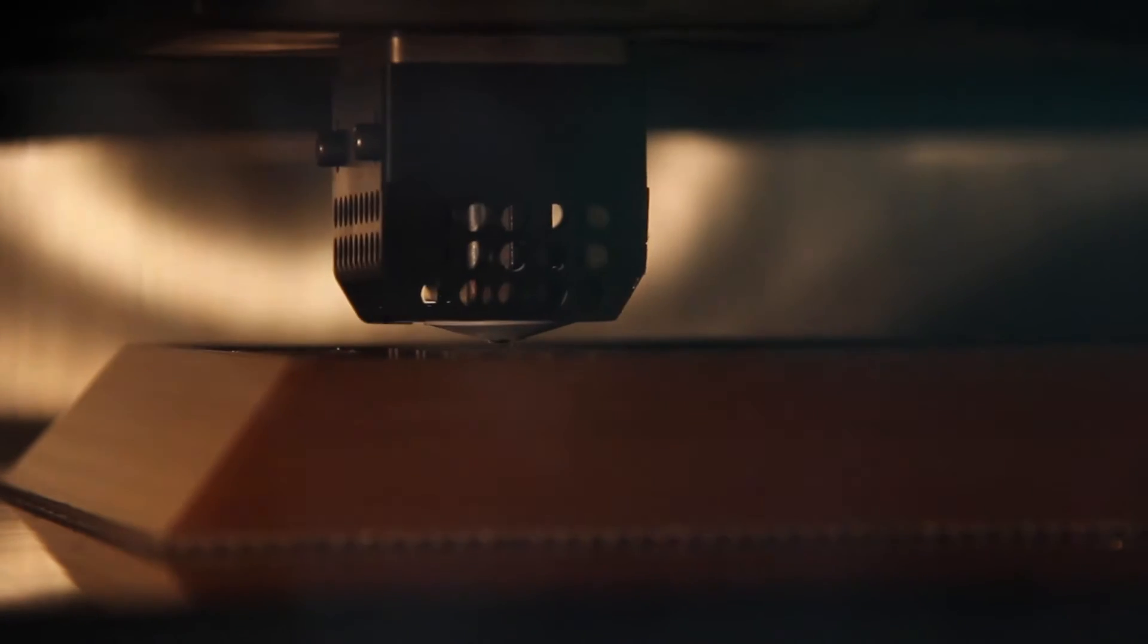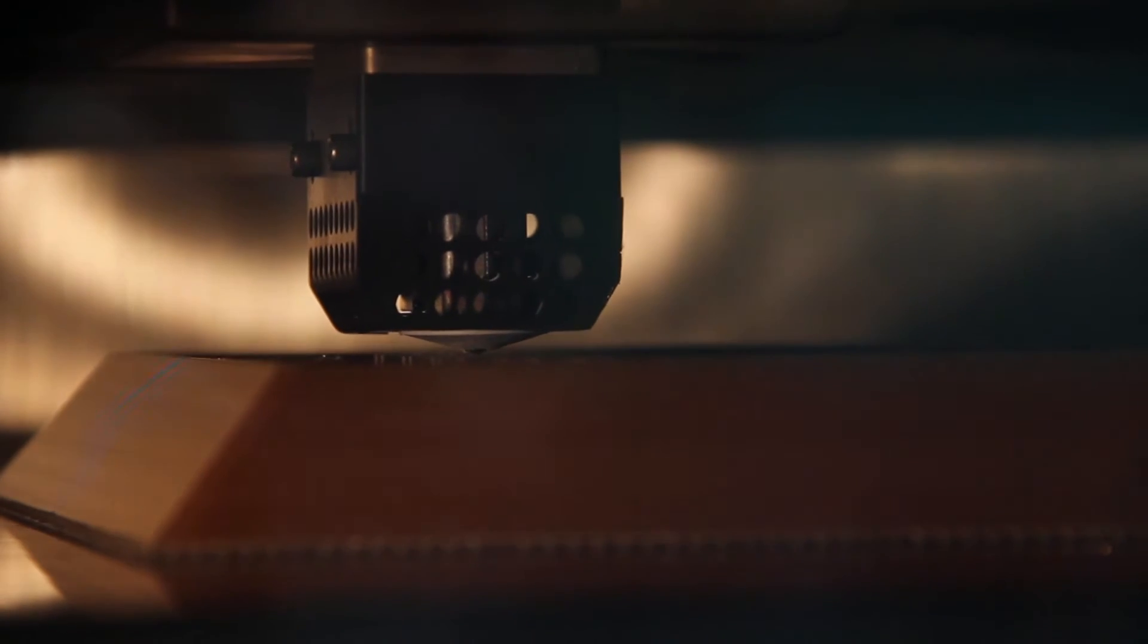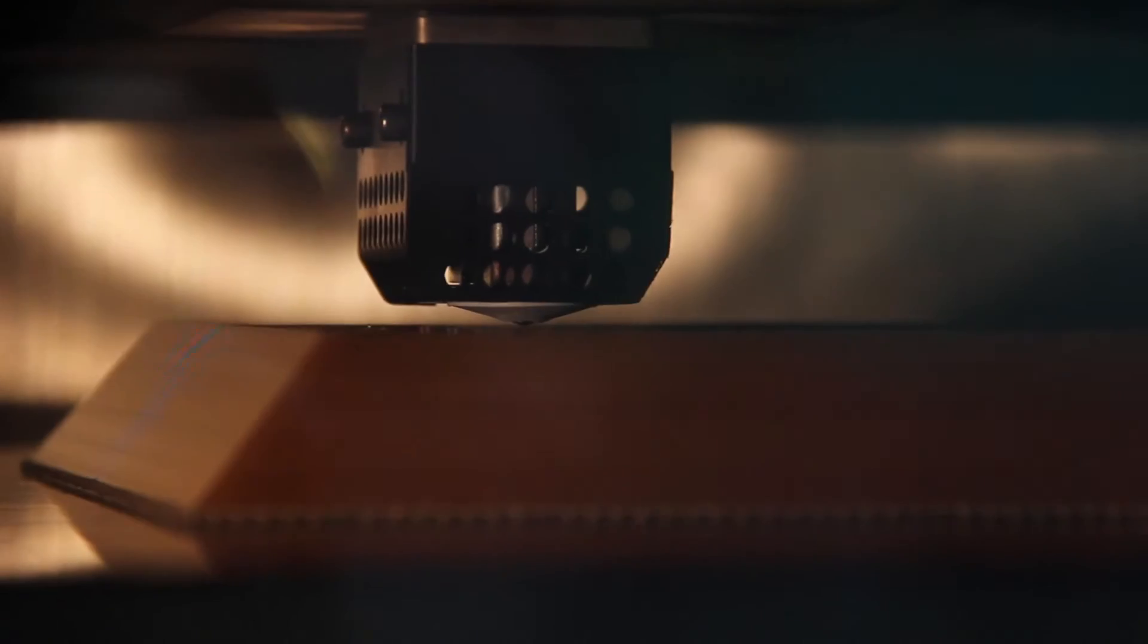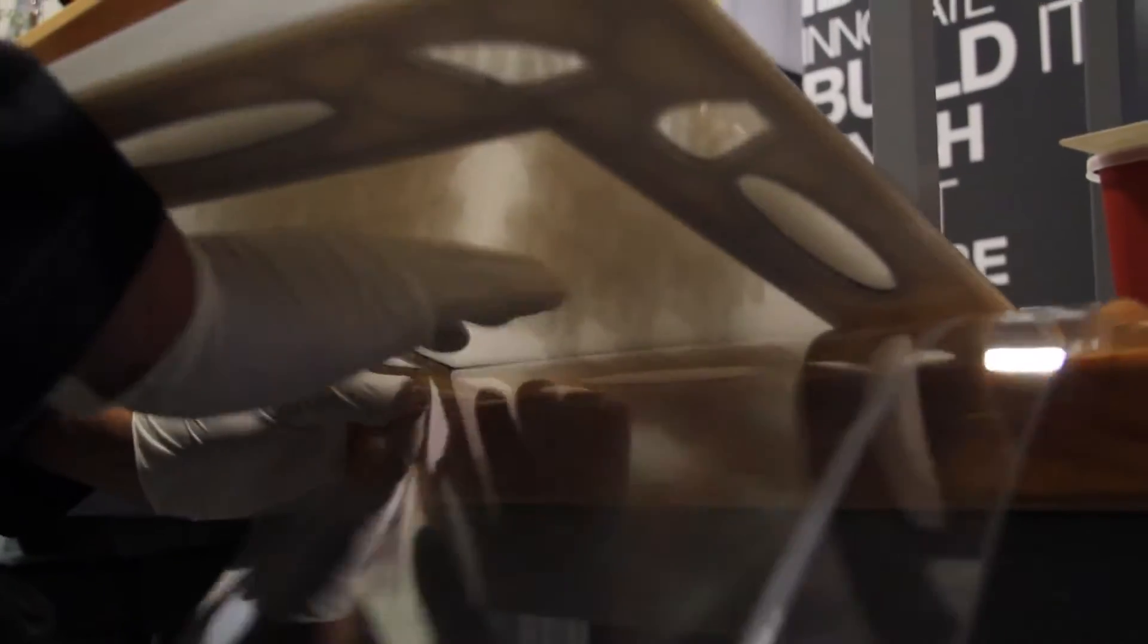The total printing time of the Pyra actually was a little over five days total build time. Assembling a working Pyra from parts is about a 20-hour process.